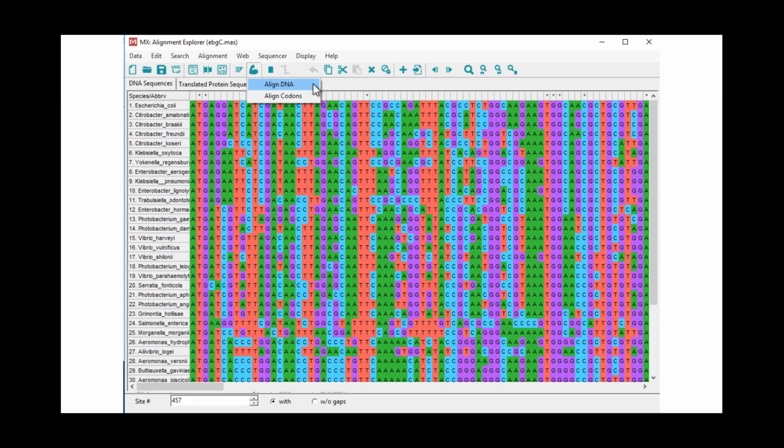When it aligns DNA, it will put gaps in places that maximize the alignment score. And MUSCLE doesn't know anything about what this DNA is for. It doesn't know anything about codons. It doesn't know anything about anything else. All it knows about is improving the score. And it will introduce gaps that fall into the middle of codons. And if you've got a codon in there, if you translate that into a protein, then it doesn't know what amino acid to put in. It's A gap G. No one knows what to do with that.